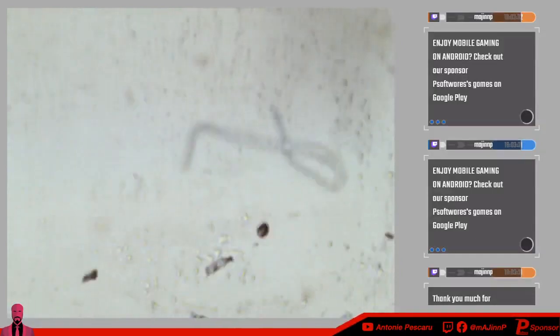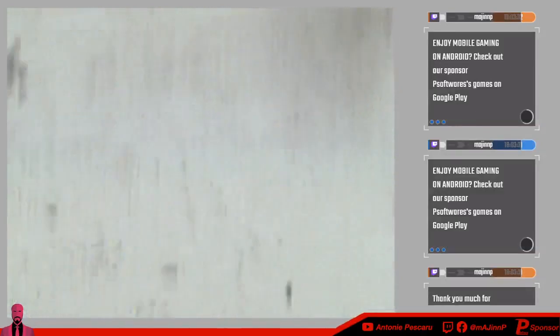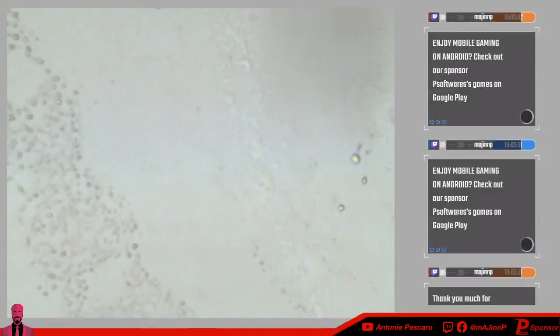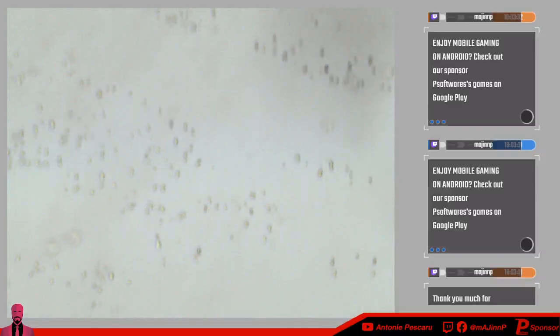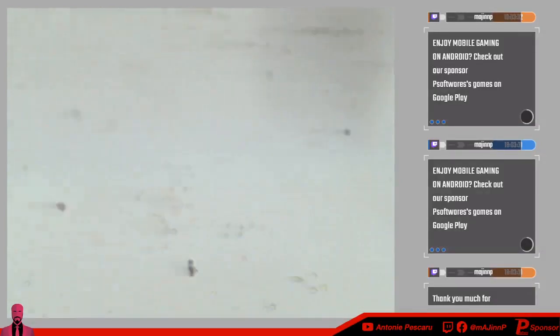It's useful to know where to spot it on the microscope, but the buccal cells are actually transparent. If I can't find them in the next 5 minutes, we're probably... oh, actually I wasn't even looking at the right place.